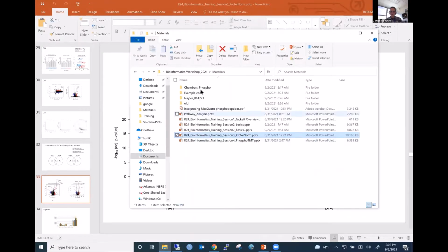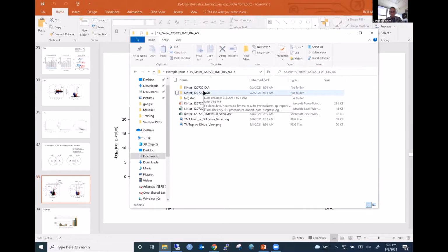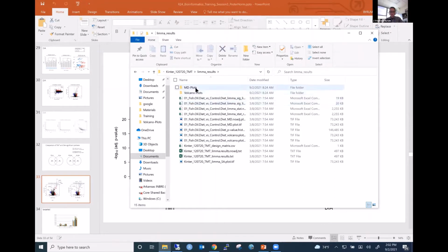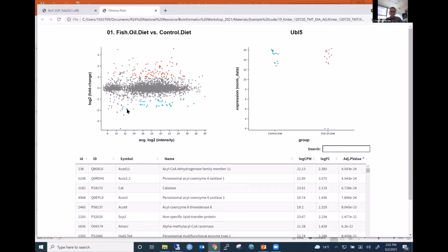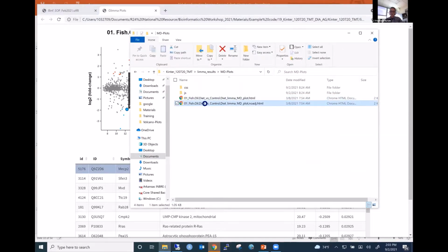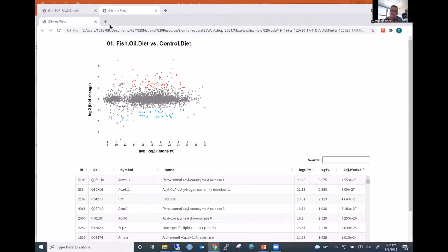Hopefully I have it on this one. I've got data everywhere. Let's go to this one. So these interactive plots are where you can really start asking questions like that. So you've got all these that are down here. Let's go to the volcano one. Come on. Computer doesn't always like to do all of this and, oops, wrong one. It's not what I wanted.